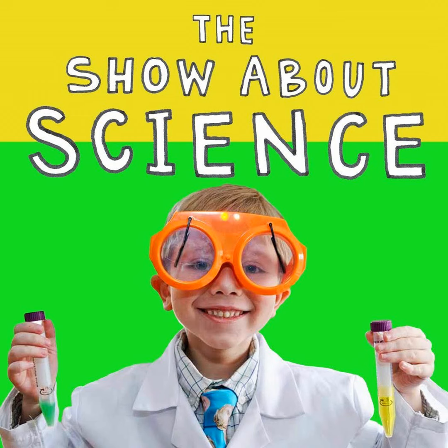Eddie, this is Nate. Hi, Nate. Hi. And so you can kind of see Eddie's got this liquid there stirring, and so he's doing a reaction where that's heating right there. And then at the top is what's called a condenser, so there's cold water. So the liquid boils up to the top in the condenser and it falls back down and it goes over and over again. There's basically this tube with two bulbs, and like there's a chemical at the bottom, and then it basically like spins around really fast, and like it basically makes the chemical go up.